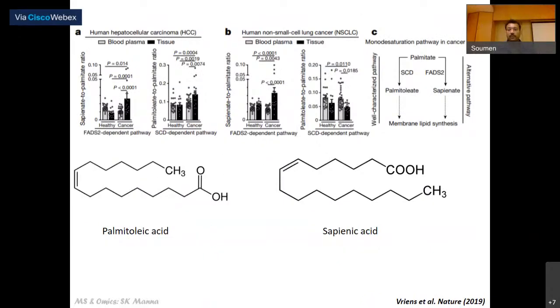So now, doing all this lipidomic analysis, all these LPCs, LPs, and all these things we have known for ages, is there something different that our ability to use mass spectrometry gives us, to advance lipidomics beyond the lipids and the biochemistry that we know?